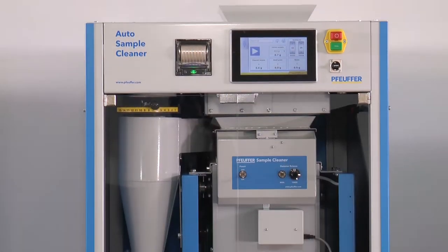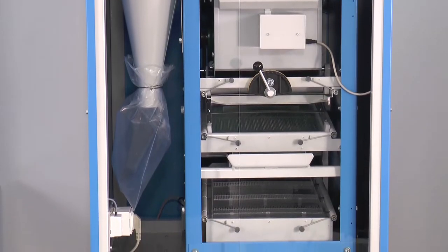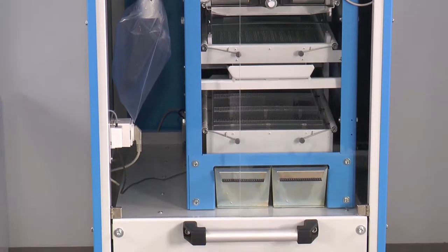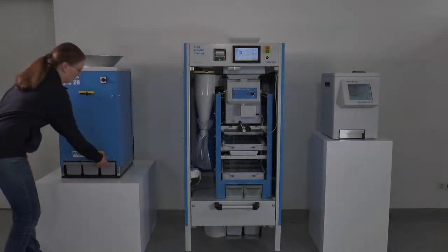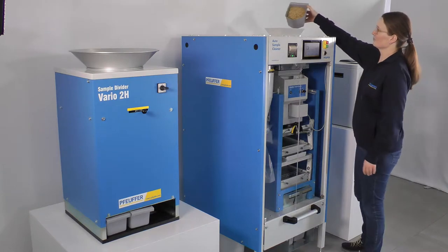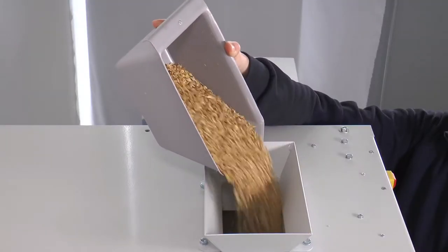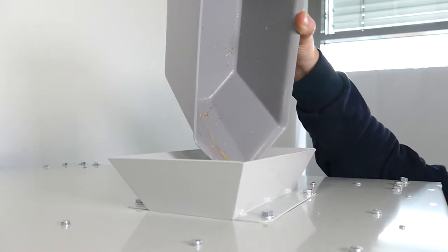The Auto Sample Cleaner is a machine that complements the SLM3 Sample Cleaner with three automatic balances to determine the percentage of dockage of a grain sample. You can evaluate the quality of the complete grain batch before running it through the full cleaning process in the facility.